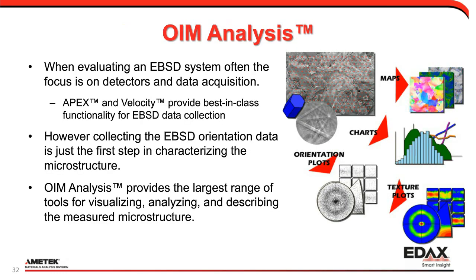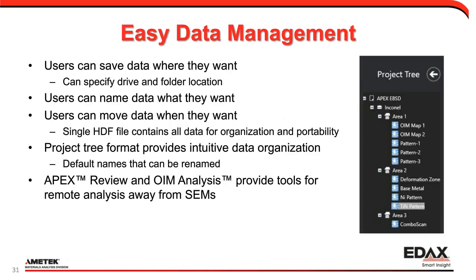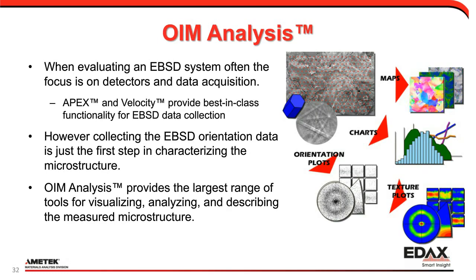So it's important to recognize that oftentimes when we're talking about EBSD systems from a commercial perspective, there's a lot of focus on the detectors. There's a lot of focus on the acquisition software. But really, it's in the analysis that a lot of the information and the science is done. And so that's where we really emphasize OIM Analysis. Sorry, this slide must have a timer on it because it keeps moving on me. OIM Analysis really provides a large range of tools for visualizing, analyzing, and describing the microstructure.